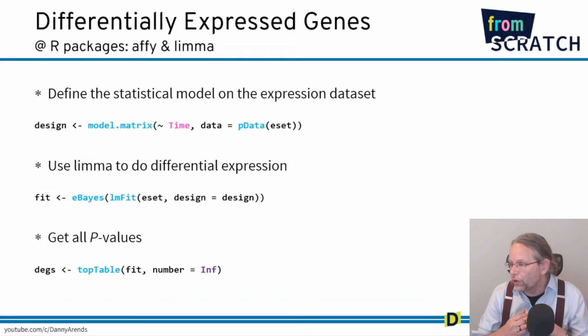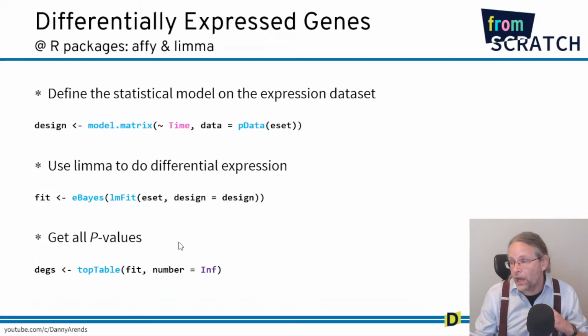Why did you not build a contrast in this case? It does that. It builds a contrast. This is where it builds the contrast. Let me show you in R. So let me just go to R.